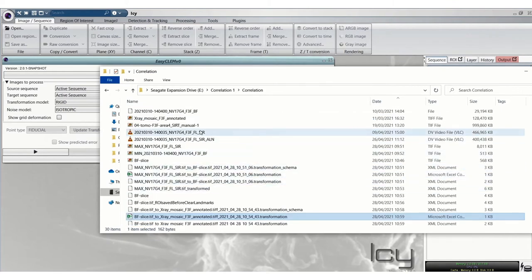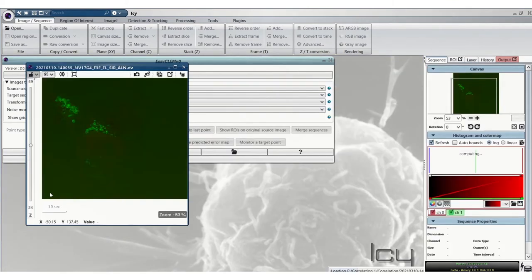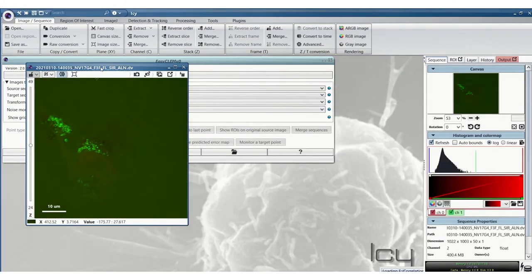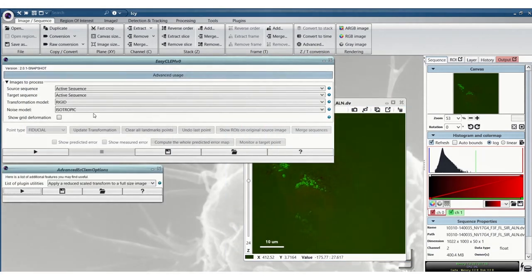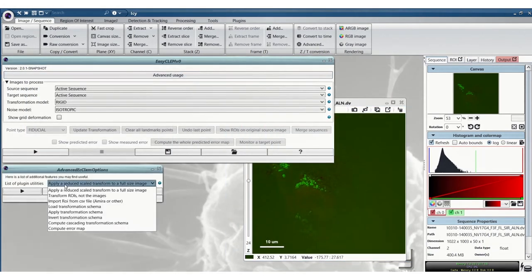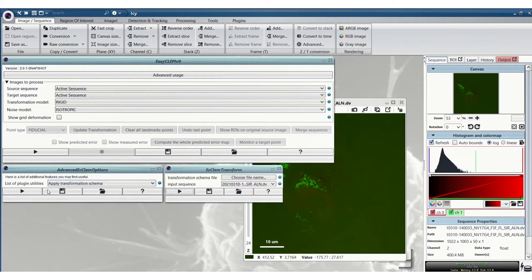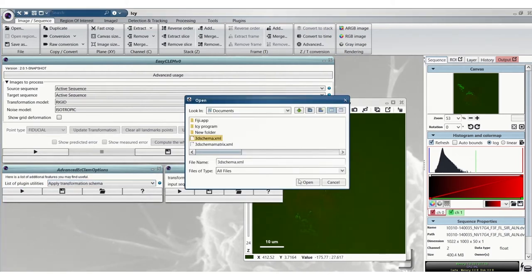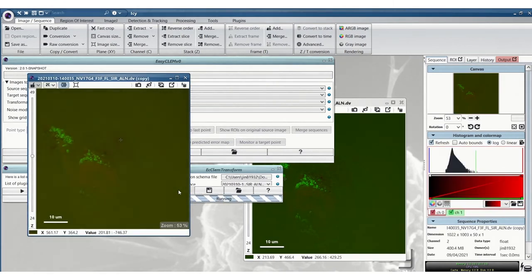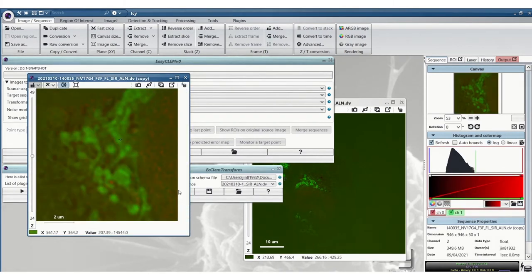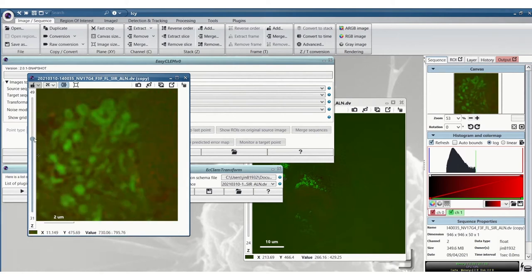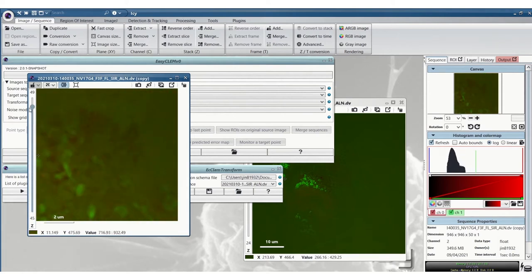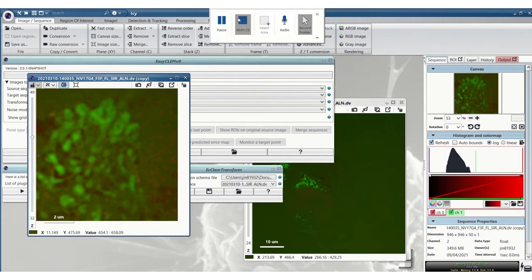So now we open the original Sim stack, the reconstructed Sim image. We go to Advanced Usage and Apply Transformation Schema. And we find the schema that we've just made and click Play. You can see now this schema has been transformed to the same dimensions as the X-ray Tomogram. And we'll need to save this for the next step.